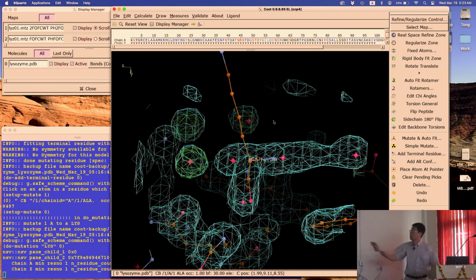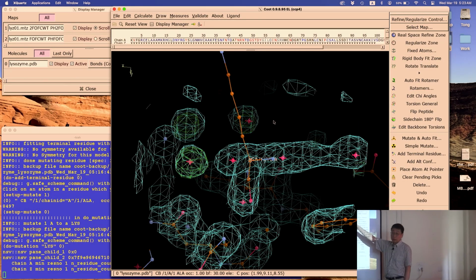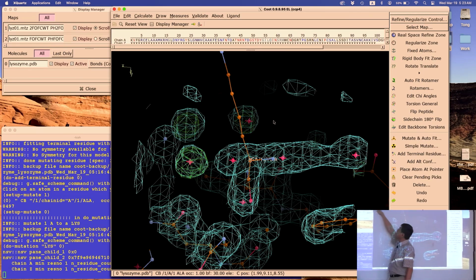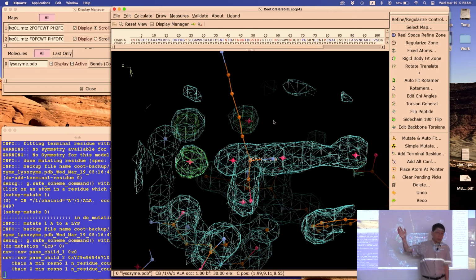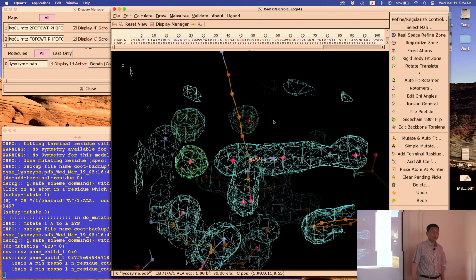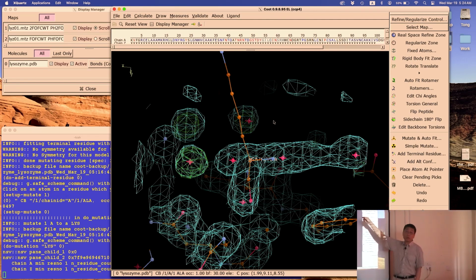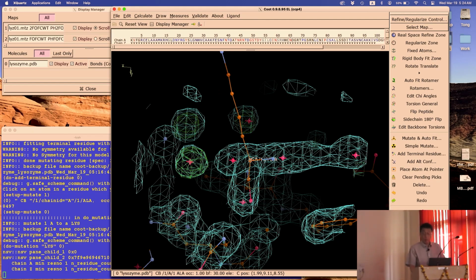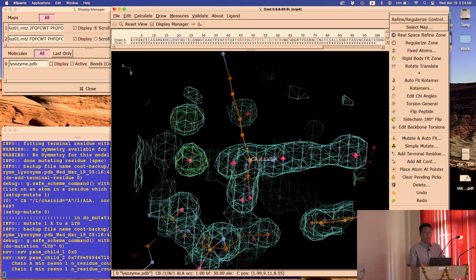So now you should have the sequence on top. And then you can just go to residue 2. Or in this case, 1. But anyway, 1 or 2. You can go there, click on that. You're right there. Okay, if you're lost somewhere, you keep this up there. You can go anywhere you like. Okay? All right. Roughly in the right spot?